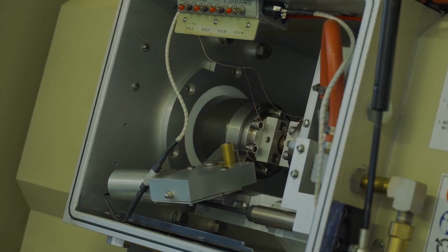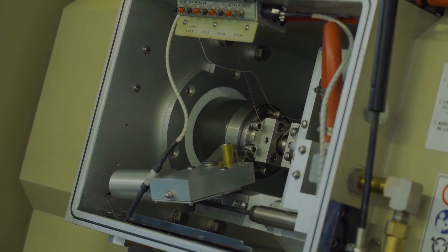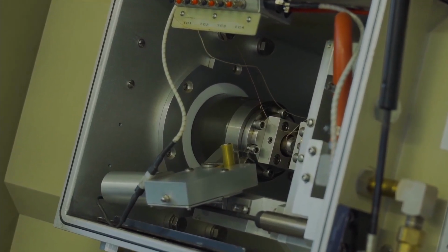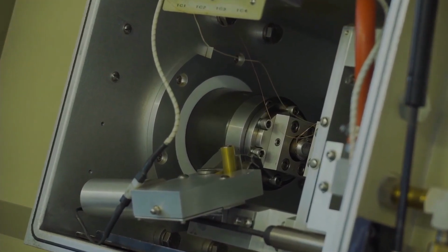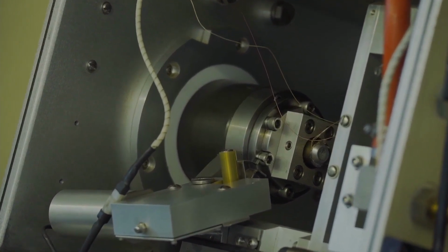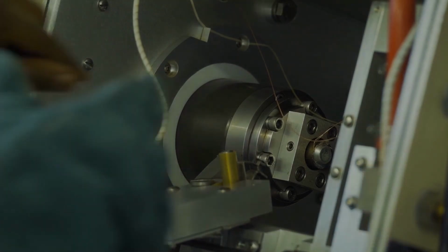And you can see as the wedge moves backwards. It's not moving by itself. I am the one actually moving it. So now I can then do stop. Because I can't put my hand there while you have the run mechanical lights on. So I'm going to remove the sample.